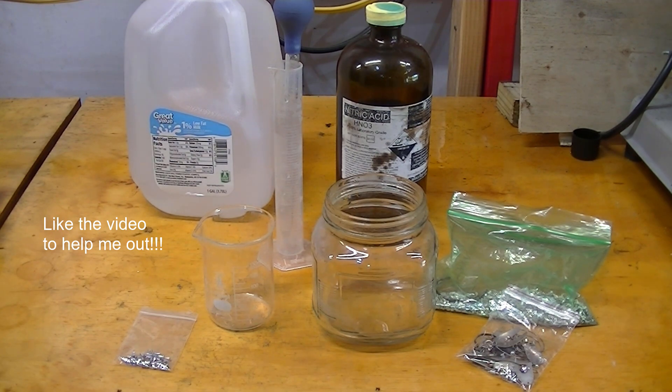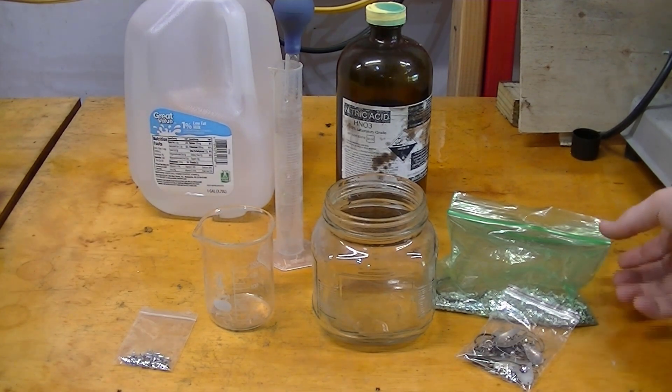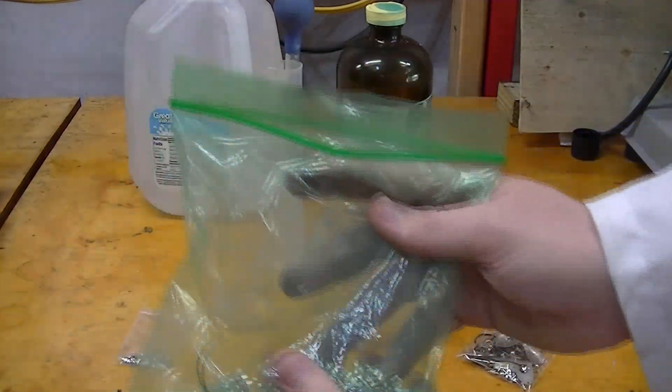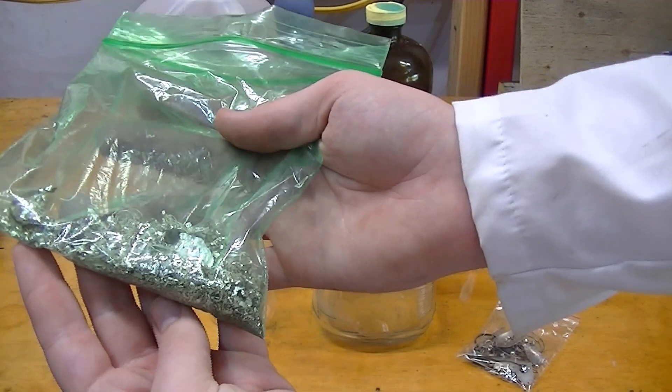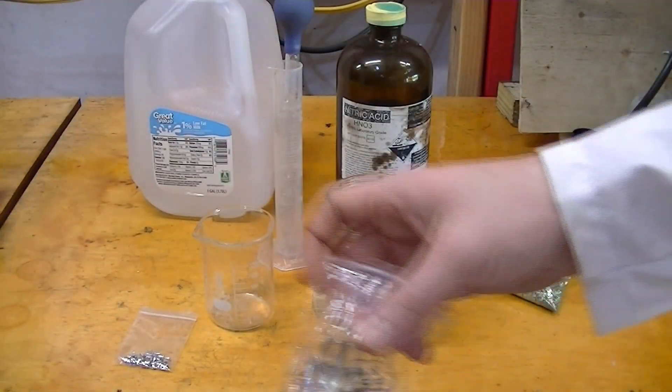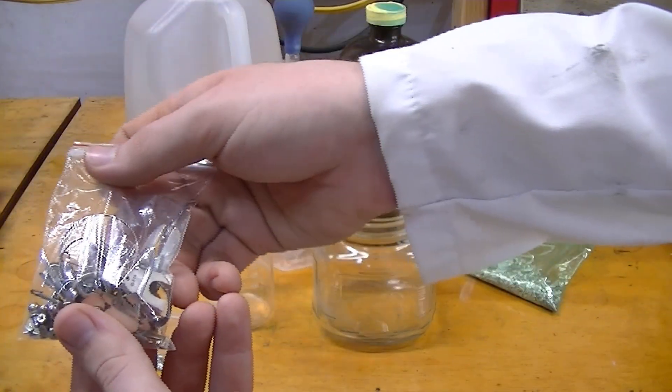On to the video. What we're going to do is turn this sterling silver into pure silver. Now, these are just scrap shavings I have from working on rings, but this is a scrap lot that I got off eBay.